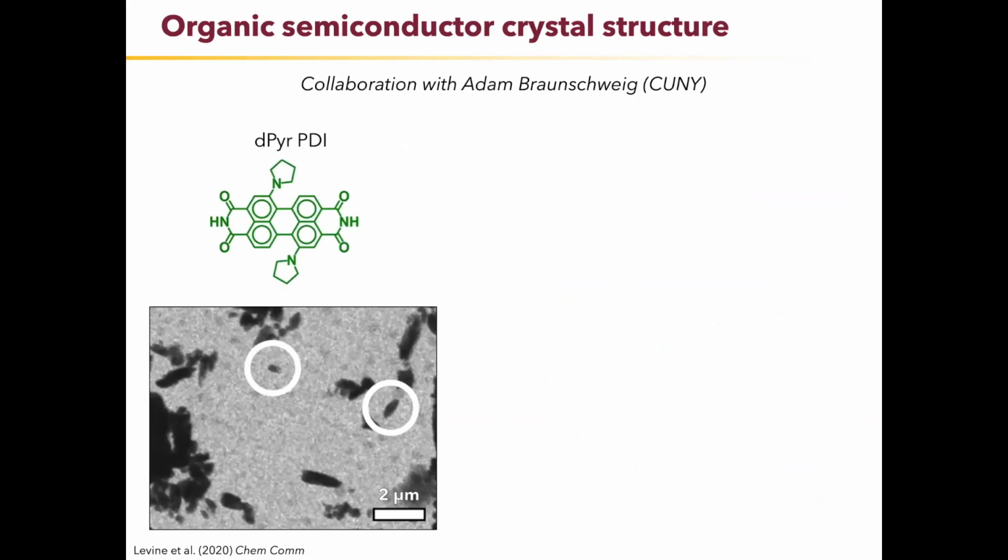Another application for small molecule diffraction, and this is an interesting collaboration between my lab and Adam Braunschweig's lab in New York. They work on organic semiconductors, and they're really interested in these crystals and how they orient in the film, because how they're oriented in thin film dictates how they perform in devices. What they would like to see is how their compounds crystallize, what the unit cell structure looks like, and then how that crystal is oriented on the film.